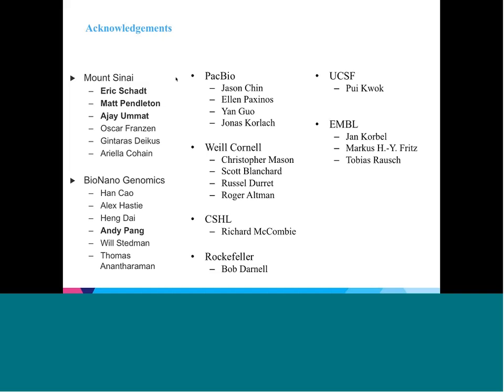So we haven't seen it on this particular assembly, but we did use it on another assembly. Yeah, so I can actually comment on that on the molecular level, Todd. We did utilize that on a Plasmodium assembly, and by doing two different nicking approaches, you can both validate some of the calls you make between the two approaches, but also use the data to your advantage to definitely reduce the number of scaffolding contigs. So as you might imagine, by introducing other nicking enzymes, you can use it in both ways to improve the assembly.